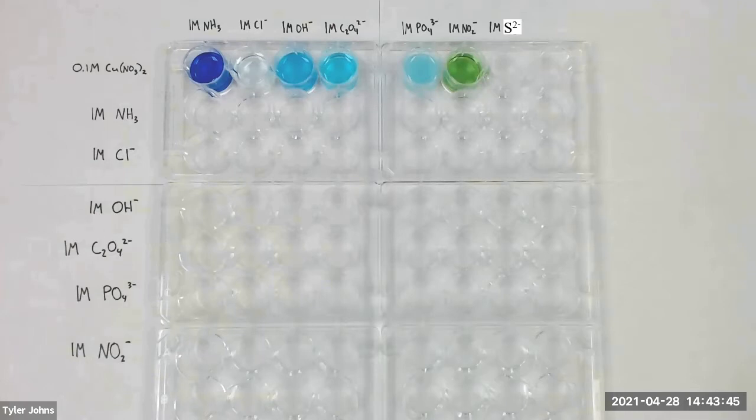In the second row of wells, we will make the same mixtures as we did in the first row. Then we will add one milliliter of one molar ammonia to the second through sixth wells of row 2. We don't need to test ammonia with ammonia.